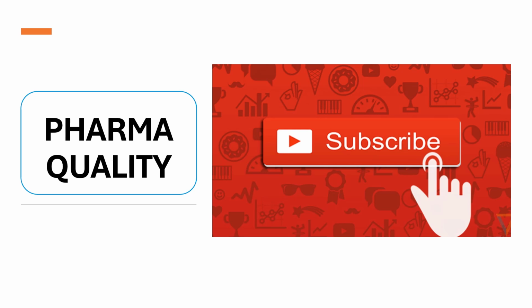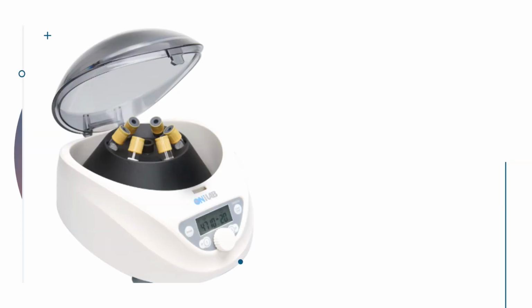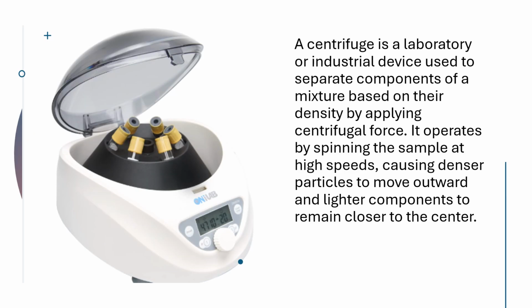So let's start with the topic. Now here we will discuss the definition of a centrifuge. A centrifuge is a laboratory or industrial device used to separate components of a mixture based on their density by applying centrifugal force. It operates by spinning the sample at high speeds, causing denser particles to move outward and lighter components to remain closer to the center.